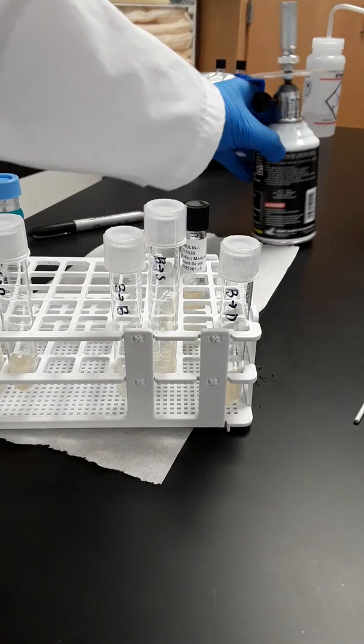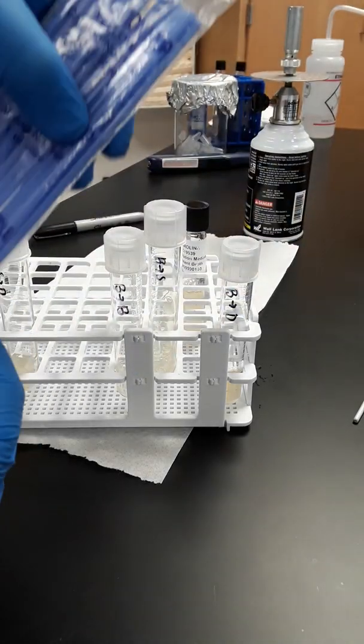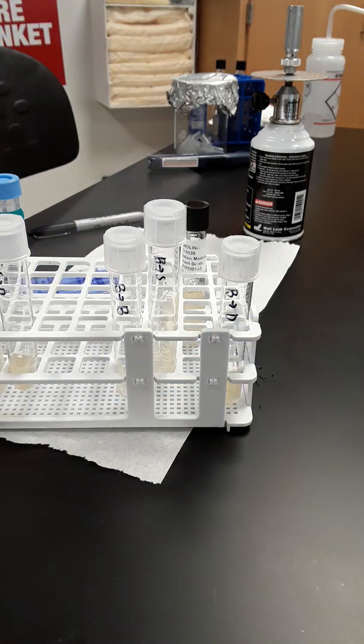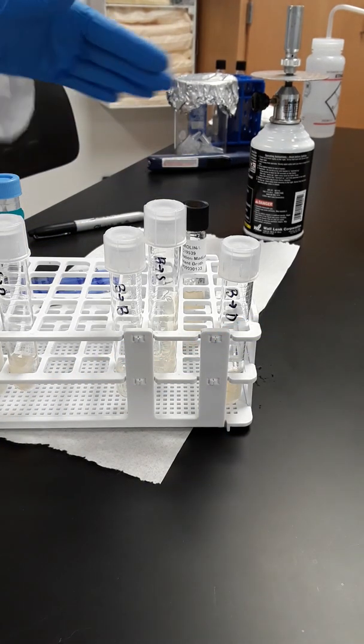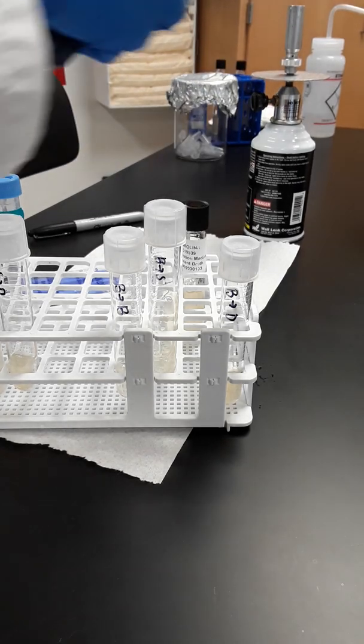Okay. So the first thing that we want to do is start our sterile technique, and we want to make sure that we have all of our tools ready. So for this lab, we're going to need an inoculation loop that has a long plastic handle. We're going to need an inoculating needle, and we're going to need our media and our starting cultures. Your starting cultures might look different than this. Depends on your instructor's preference.